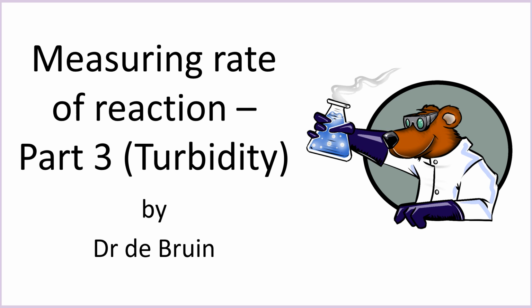This is a tutorial video showing you one method you can use to collect data that will allow you to calculate the rate of a chemical reaction. In this video, we'll look at how to measure the rate of a reaction that becomes turbid, which is one half of the GCSE Chemistry Required Practical for AQA.